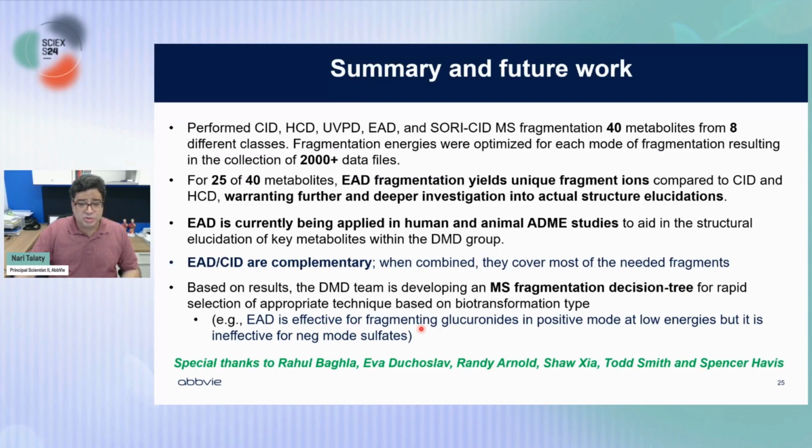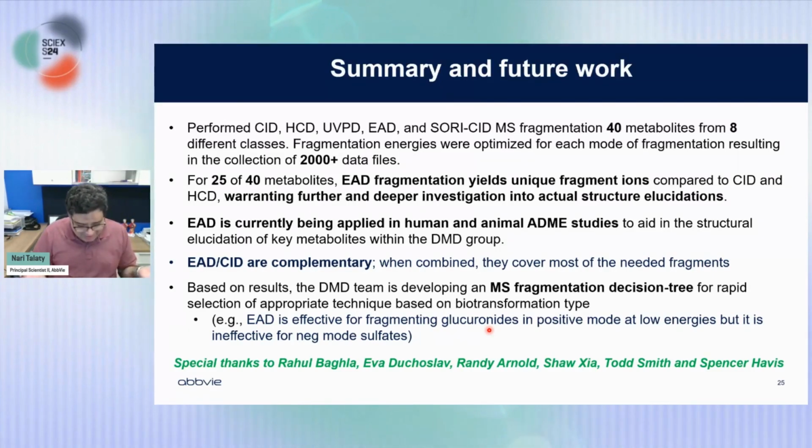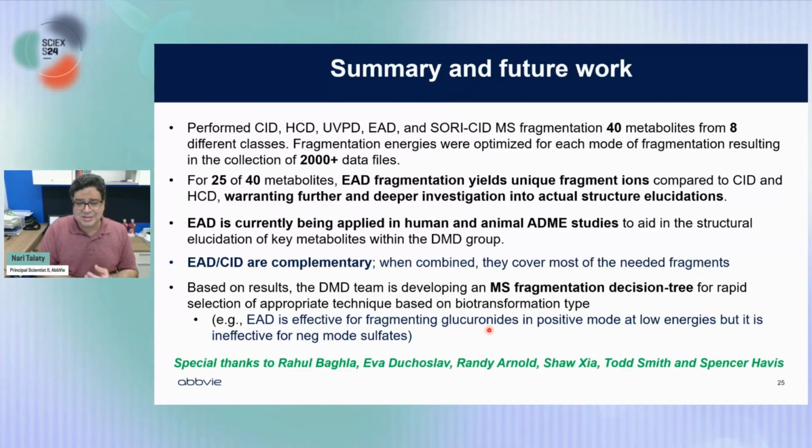There are some conclusions that, yes, glucuronides work beautifully, and SciEx has published on this extensively, and there have been some great presentations at ASMS as well. We're not the first to do this, but we're definitely finding it useful. We're seeing these extra peaks that totally make sense and allow you to solve the structure. So definitely EAD is powerful. We are finding that so far.